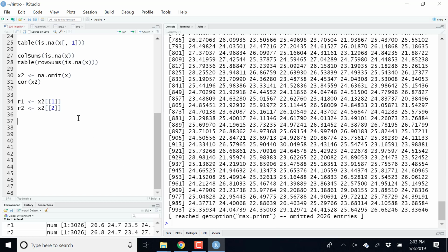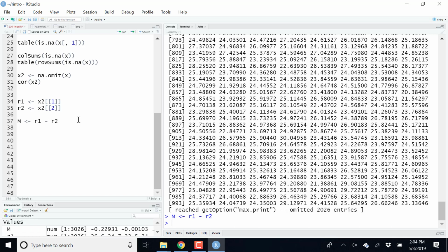And so if we're interested in replication, or to what extent our experiments are reproducible, in this case it's probably much better to do the following. I'm going first to calculate, also these are log2 values. So if I want to calculate a fold change in log, I need to take the difference between my intensities.